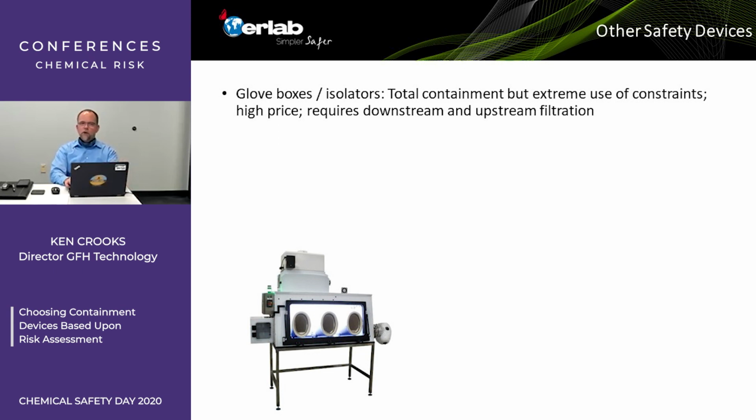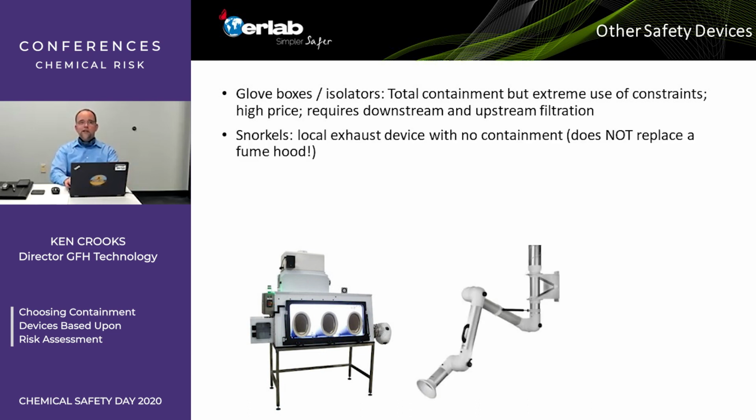But again, if you're working with the CMRs, the highly toxic, immediately lethal stuff, you have to work with one of these, or highly recommended anyways. Snorkels. This is the opposite end of the spectrum. So now you're working with more of a nuisance odor or a heat generator in a lab.